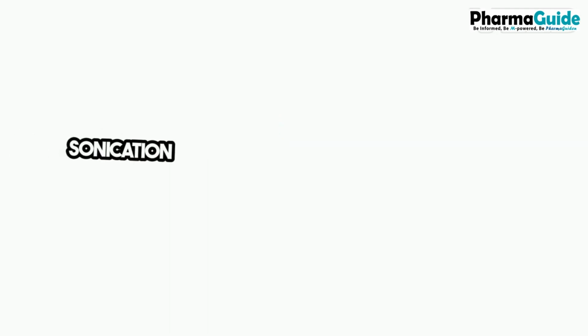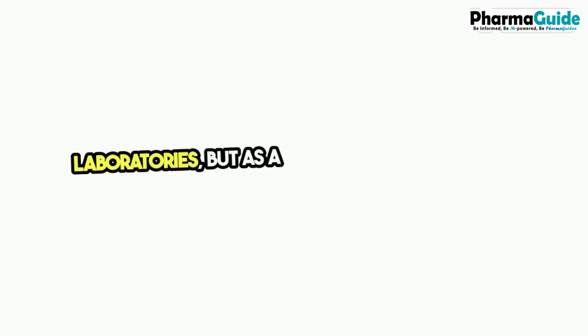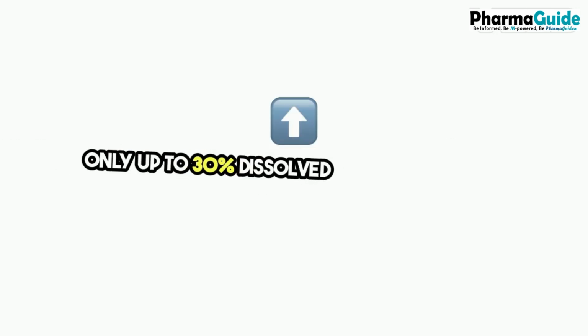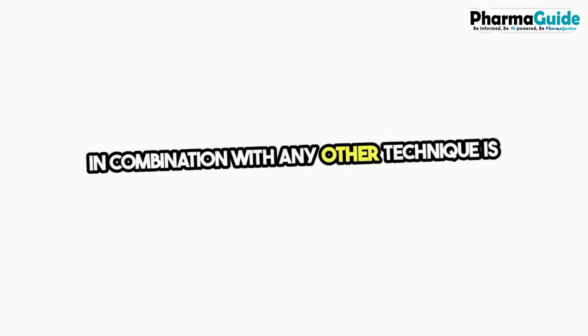Sonication using ultrasonic baths is common in most laboratories, but as a standalone technique, it removes only up to 30% dissolved air, so sonication in combination with any other technique is recommended.